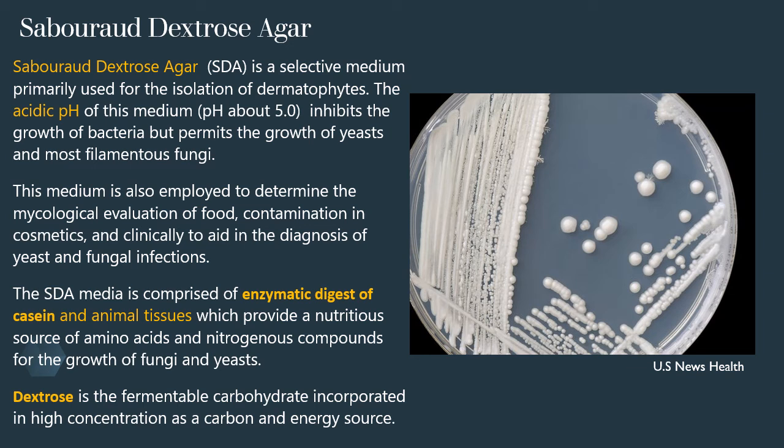It is also widely used in the pharmaceutical industry. The picture given here shows growth of Candida. This medium is also employed for mycological evaluation of food, for detecting contamination in cosmetics, and clinically to aid in the diagnosis of yeast and fungal infections. You can see it has a wide use in many fields.